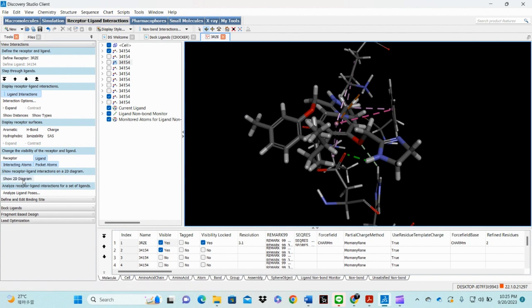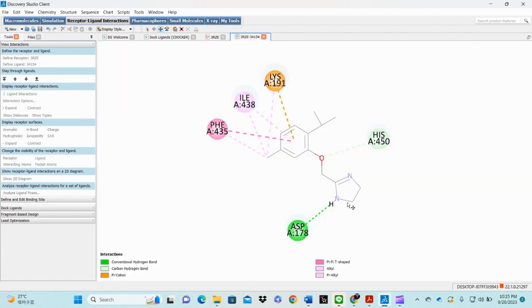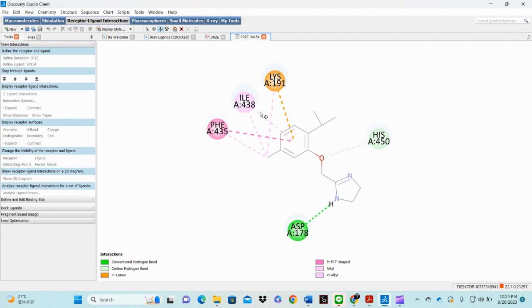Under Ligand Interactions, you can check its 2D view. Here, this is our ligand molecule, and these are the interactive residues present within the active site of the receptor which show interaction with the ligand molecule. The green color shows conventional hydrogen bonds, the light green shows carbon hydrogen bonds, and the others are hydrophobic interactions — pi-pi interactions and alkyl interactions.